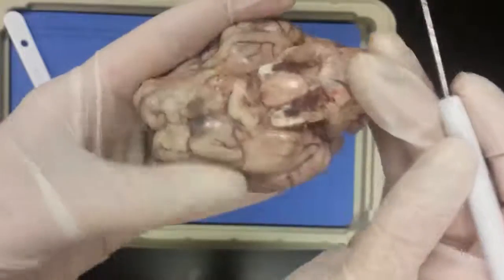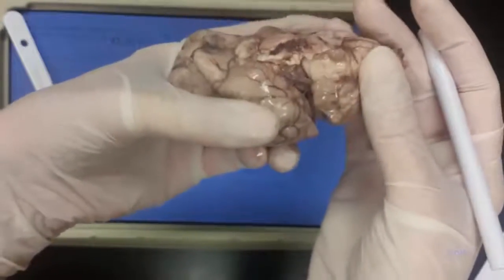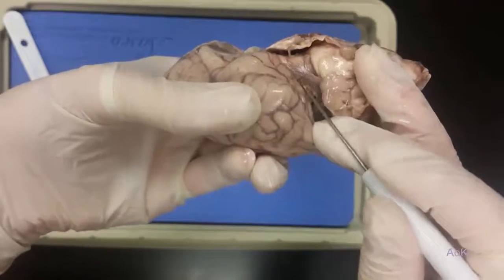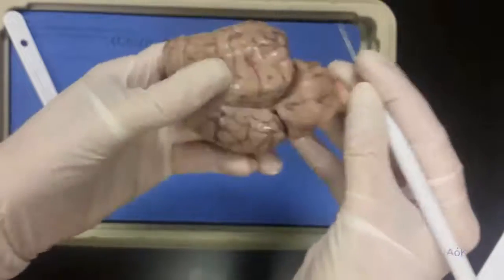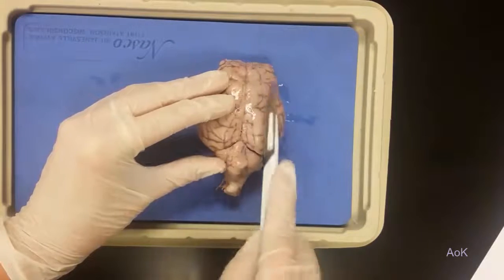You can also find some additional meninges when you try to separate the cerebellum from the cerebrum. You can see these meningeal layers right here. You should cut the brain in half using the longitudinal fissure.